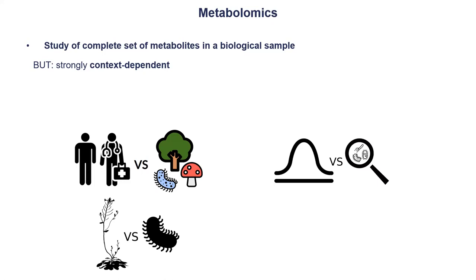Do we want to quantify something? For example, in a knockout study, do we want one compound that is no longer in any sample, or do we want to see upregulation or downregulation? Or is it only important that something is in one sample and missing in another? So do we want to quantify, or is qualification already enough?